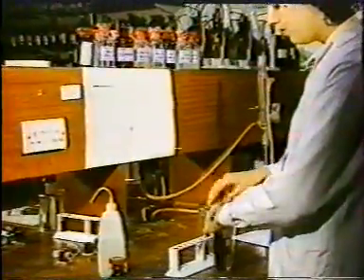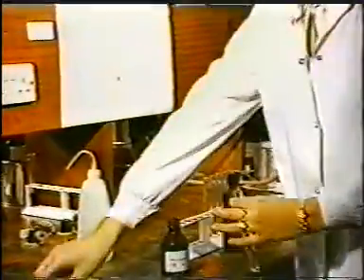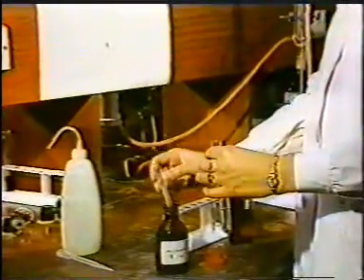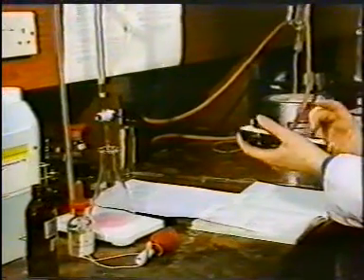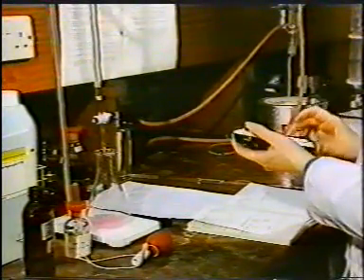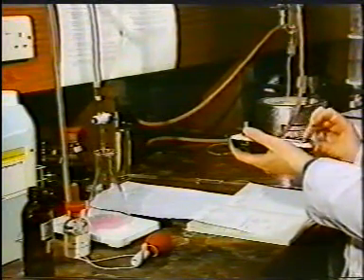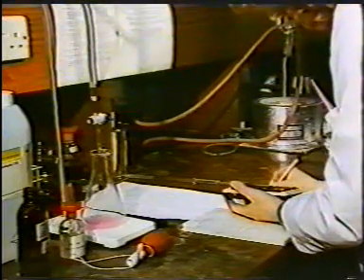In the quality control lab, the general appearance of the sample will be examined together with the labelling. Testing will be carried out to confirm the identity of the product, together with an assay to determine the content of active ingredients. Other tests may be carried out if appropriate, such as pH determination, or tests for degradation products.